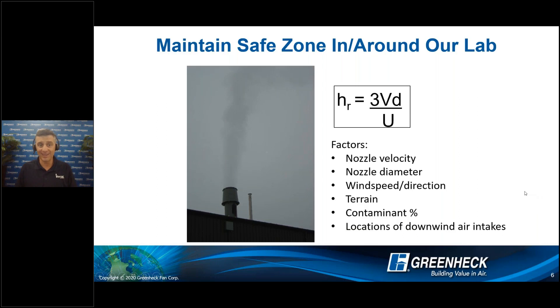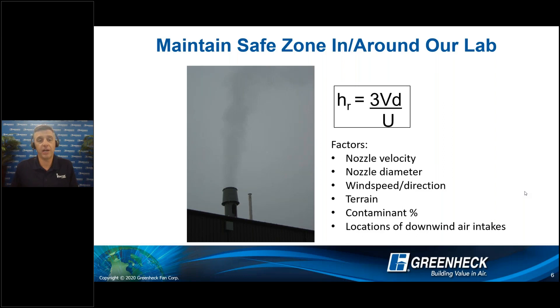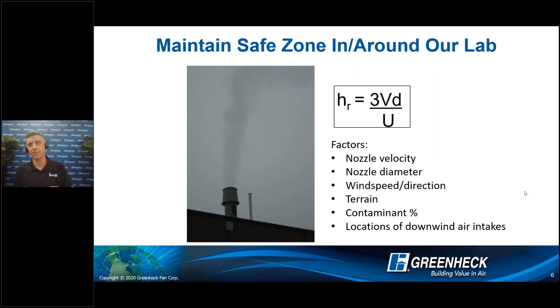ANSI Z9.5 talks about velocity. You'll notice on these systems we have a conical discharge nozzle decreasing the area with the intent to get velocity to 3,000 feet per minute or more. That combination of velocity and stack height helps get the effluent up and away from the facility — making sure we have clean air for researchers. Factors include nozzle velocity, diameter, mass flow, and momentum to get that effluent away. We also consider wind speed, direction, terrain, percent contaminant, and locations of downwind air intakes.